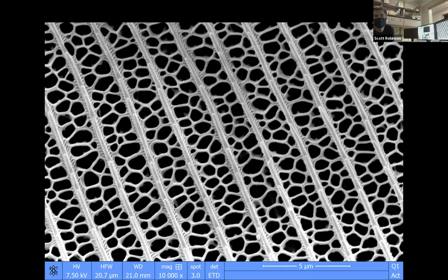Sometimes, when we look at these things that we're looking at right now, magnified 10,000 times, you'll also see pigment granules. So some of them are structural colors, and sometimes they also have pigment granules in these little features that we see between the ribs.